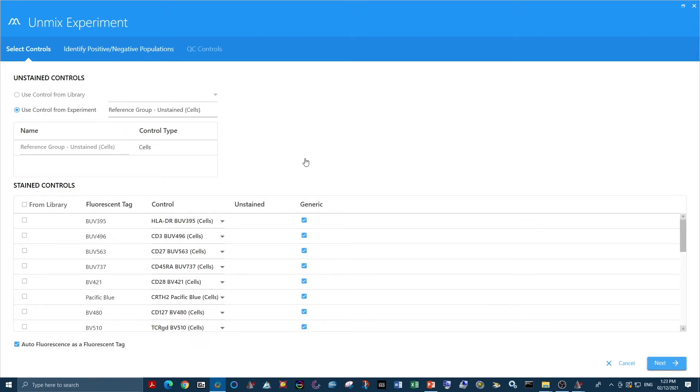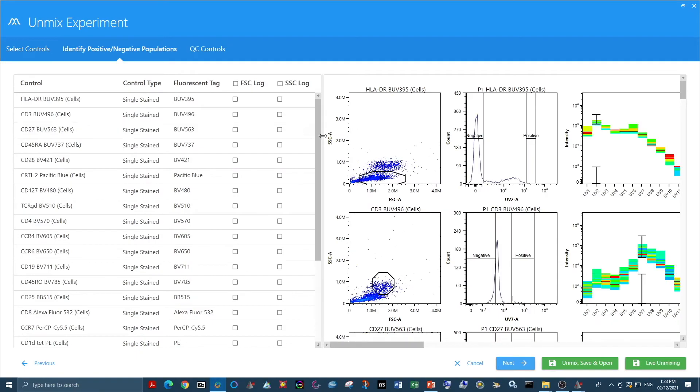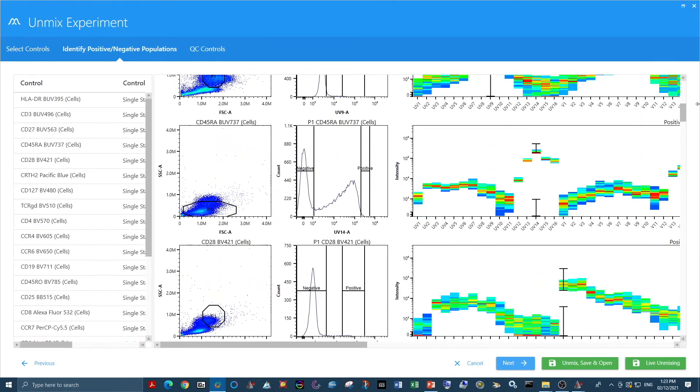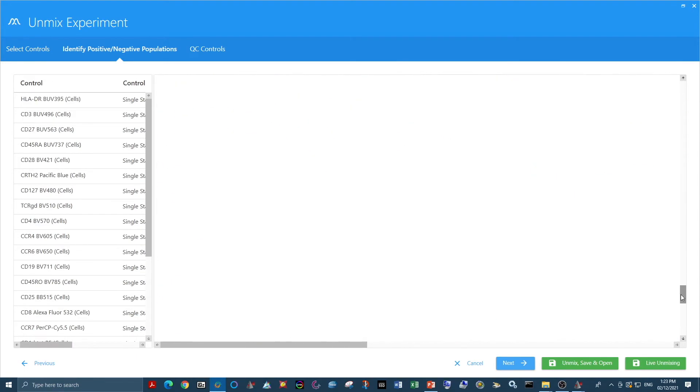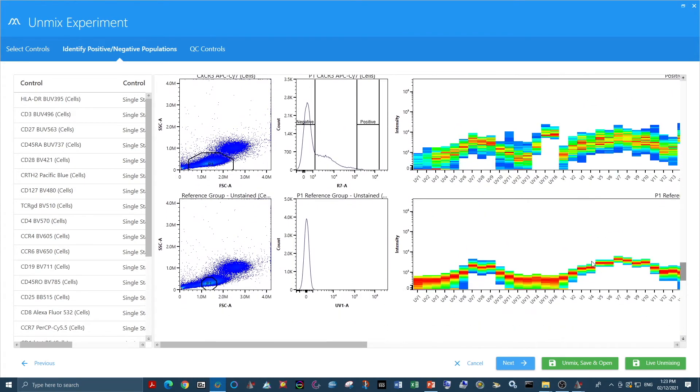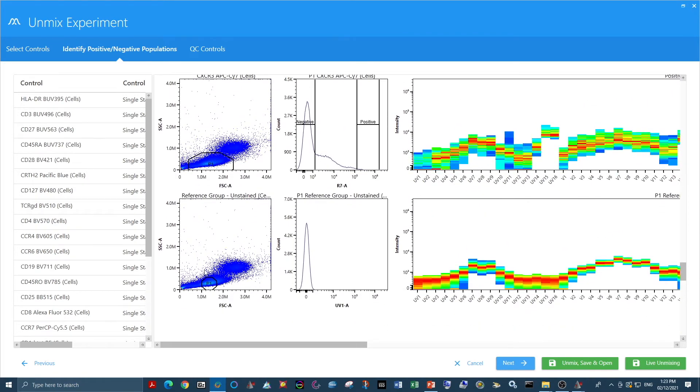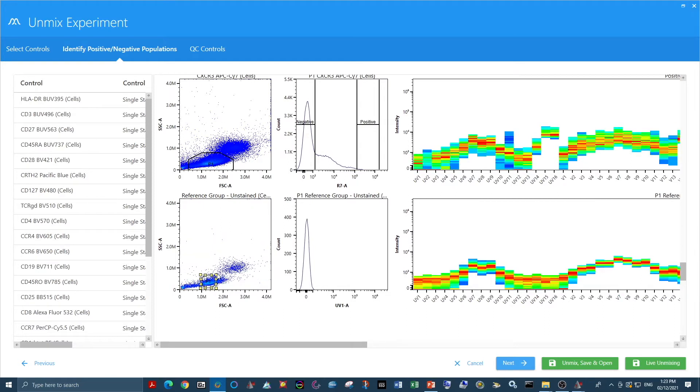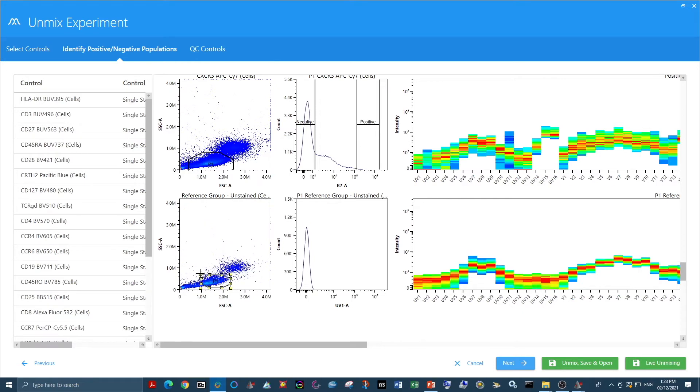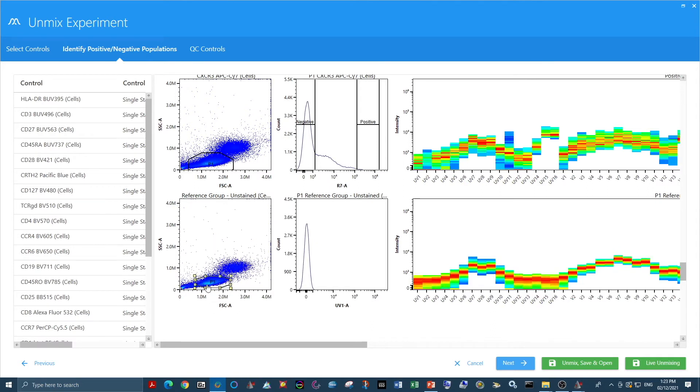Once we go into the unmixing wizard and set our gates, we come down to the unstained where autofluorescence is defined. We want to be sure that we are gating only on our population of interest, as we only want to extract the autofluorescence of the cells we will be analyzing in the unmixed sample. In this case, I only want to gate on my lymphocytes.